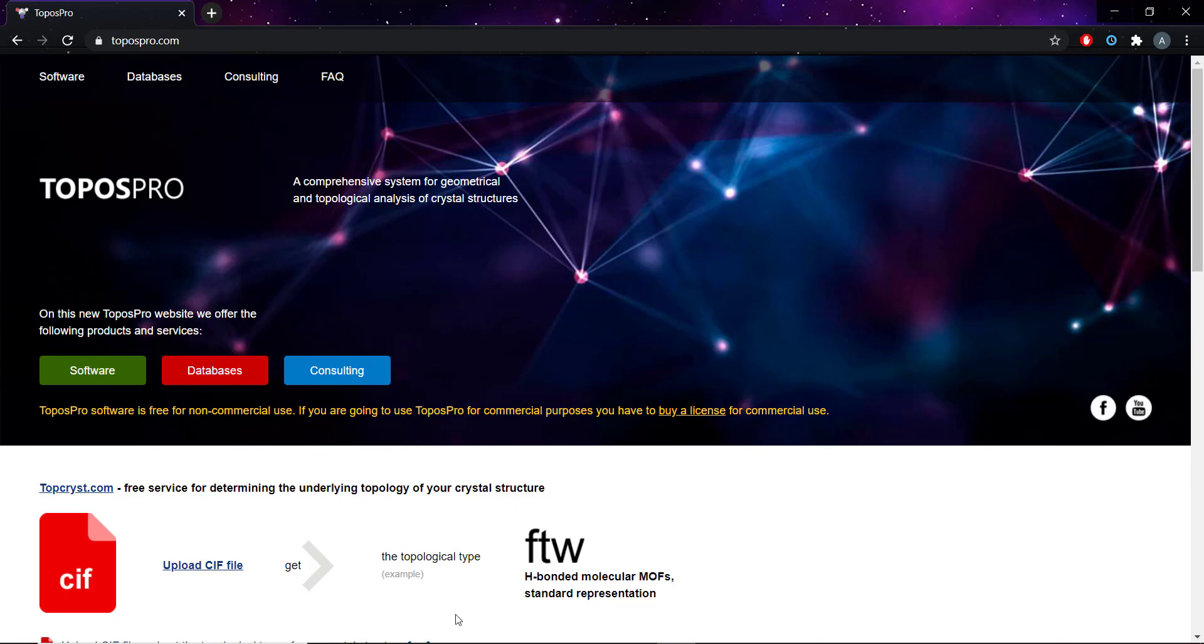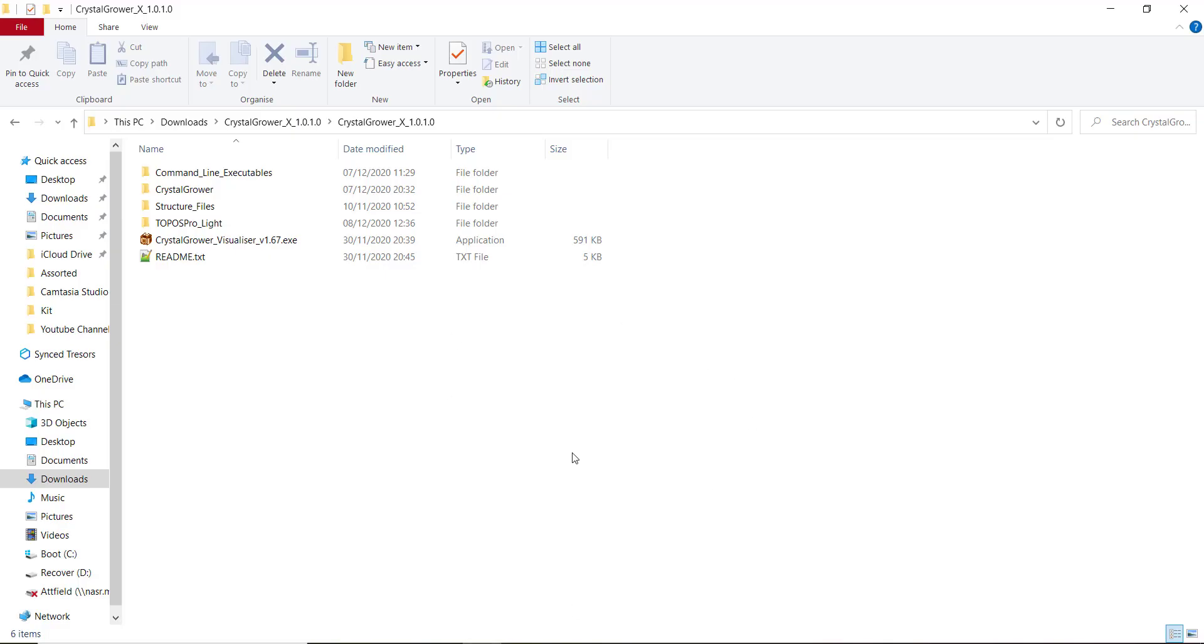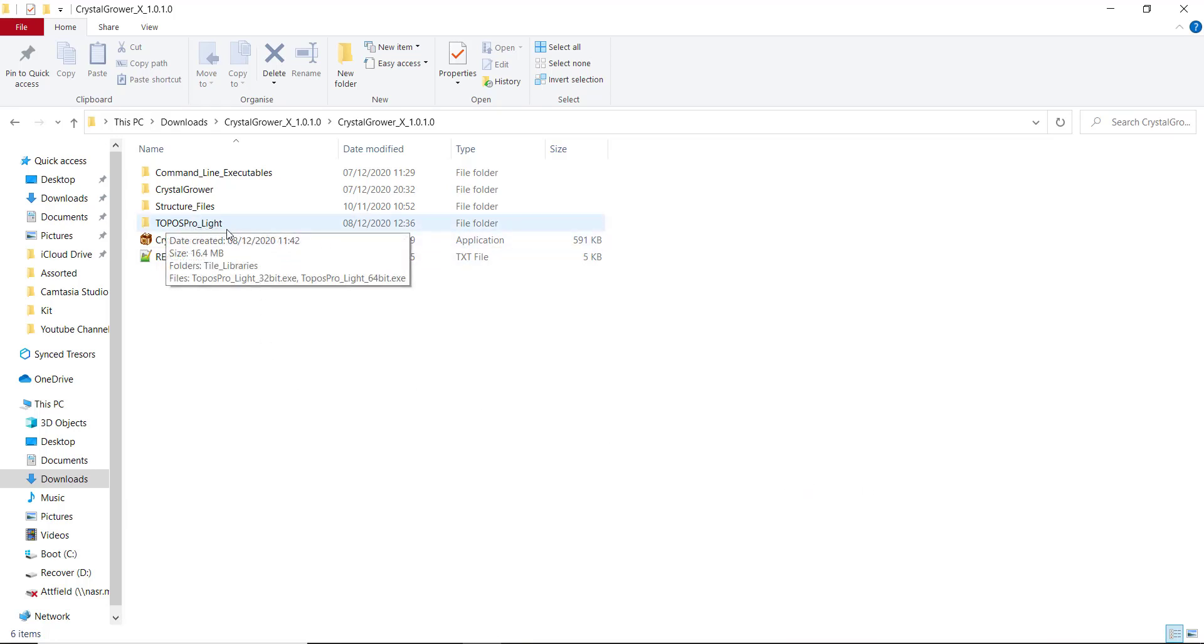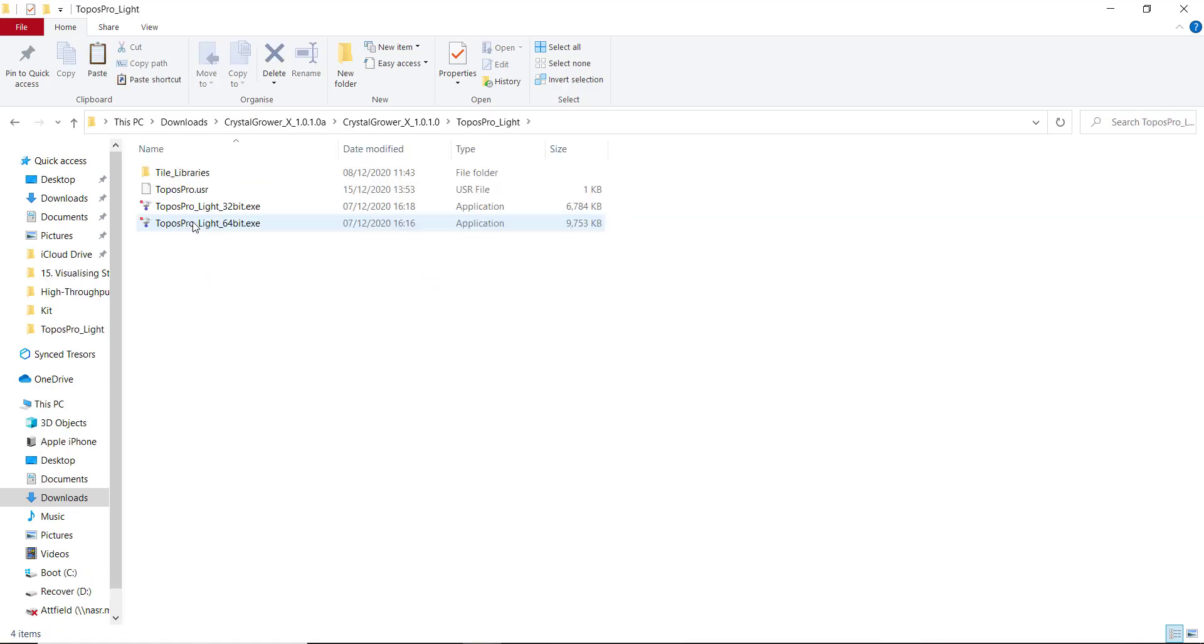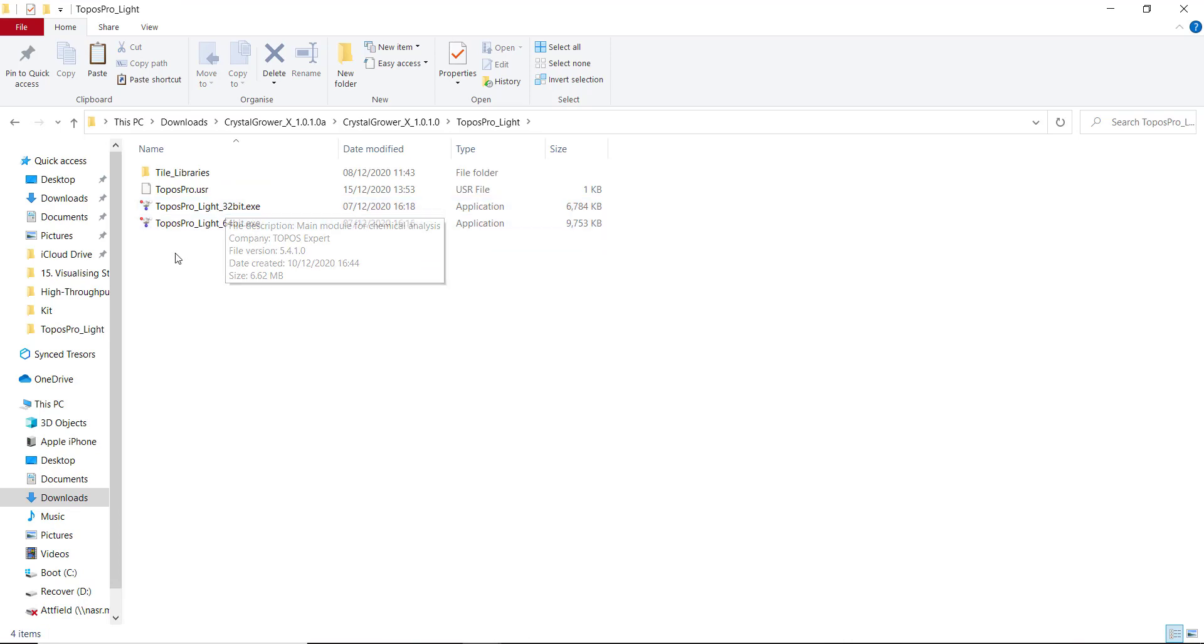When you download the zip file containing Crystal Grower, you also have this folder here, which is your ToposPro Lite. If we open this folder, you can see it contains two executables for ToposPro Lite. One being ToposPro Lite for a 64-bit system and one for a 32-bit system.